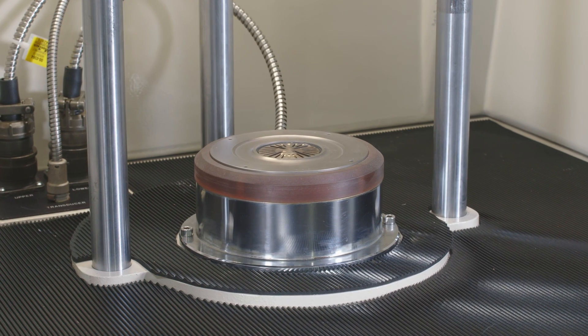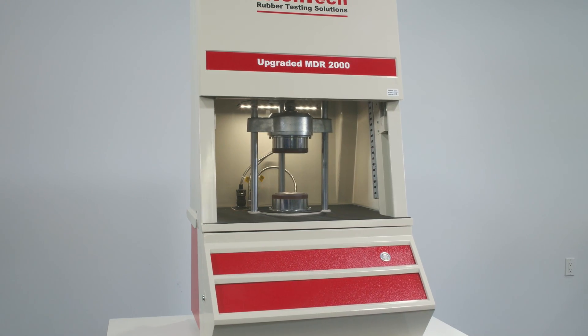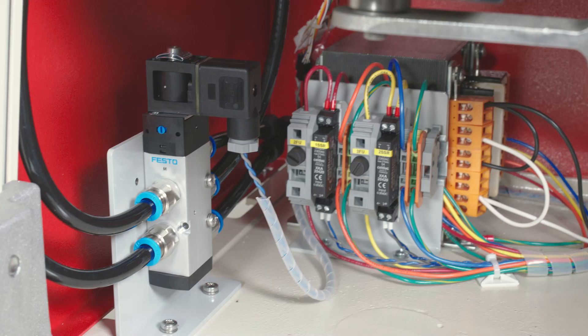Each machine is completely disassembled and the frame is glass bead blasted, cleaned and repainted inside and out. The main cylinder is rebuilt, tested and equipped with a new solenoid valve.